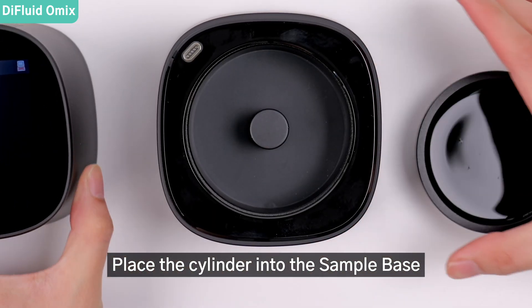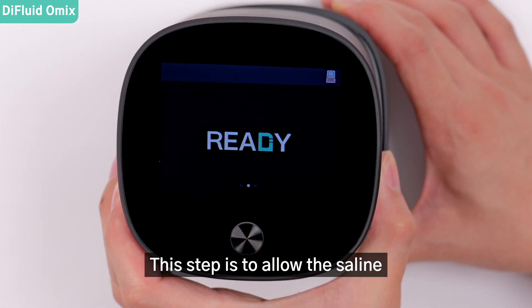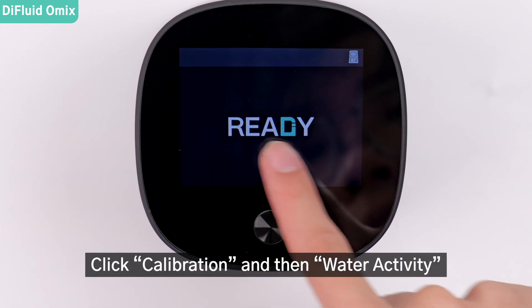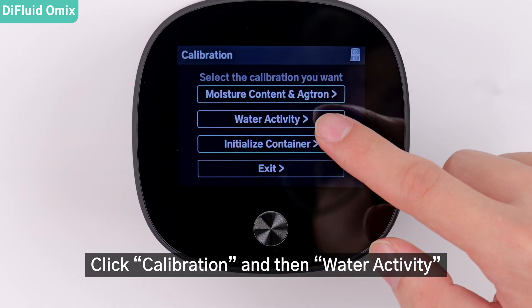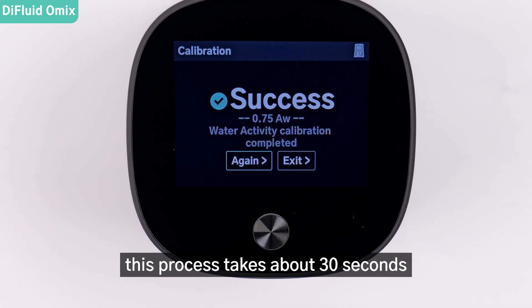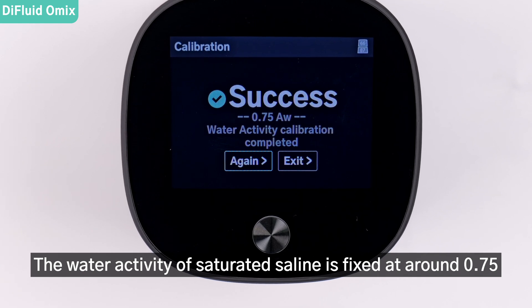As long as the surface of the sample container is covered, place the cylinder into the sample base, cover it with the main unit, and wait for 2 minutes. This step is to allow the saline in the device to reach thermal equilibrium. Click calibration, and then water activity. This process takes about 30 seconds.